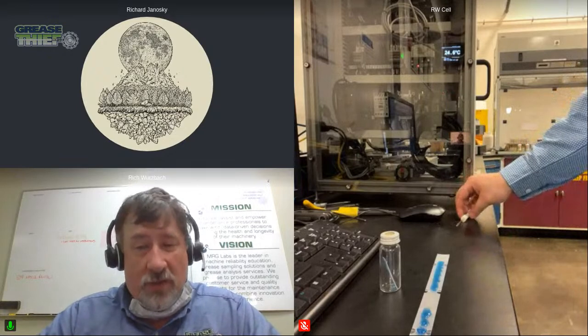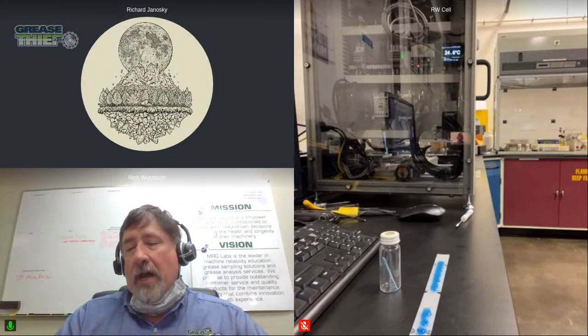And the more you understand about grease, you begin to recognize that that is a technique that adds some value for oil analysis, but is very troubling when you see it being used for grease analysis because of the way it measures and assumes certain things about how that sample has been prepared. And it's just one example. So in this ILS, we're encouraging participants to test the grease samples they're receiving with different types of instruments, different approaches, different preparation methods, hopefully helping us understand those different things.